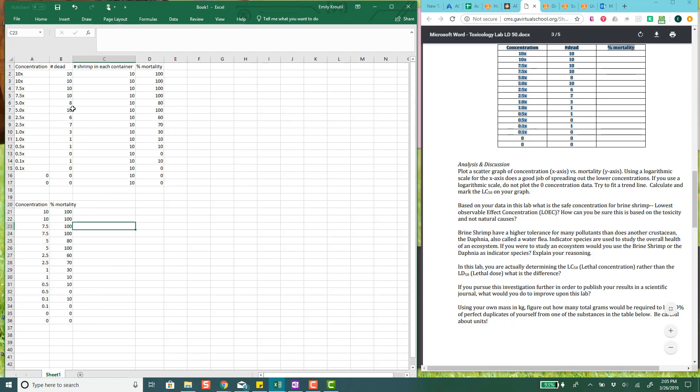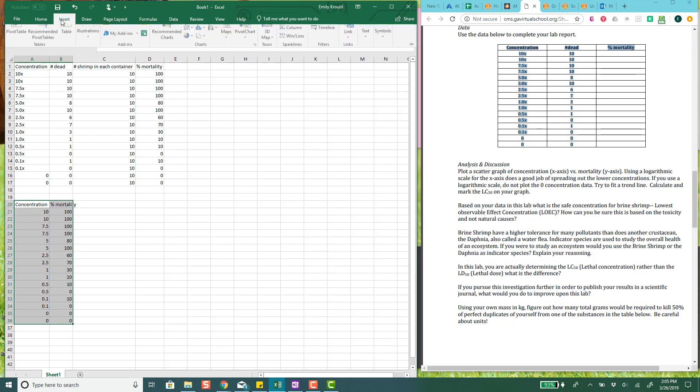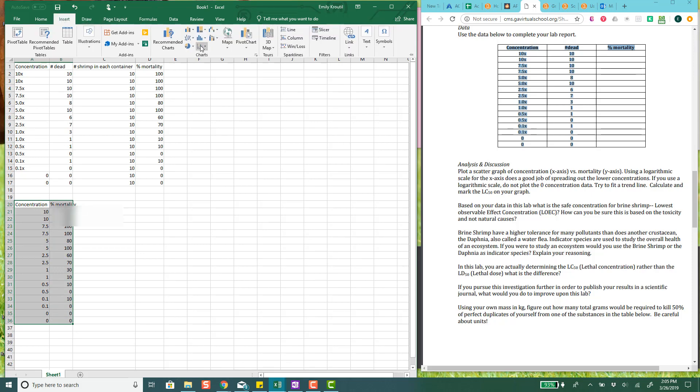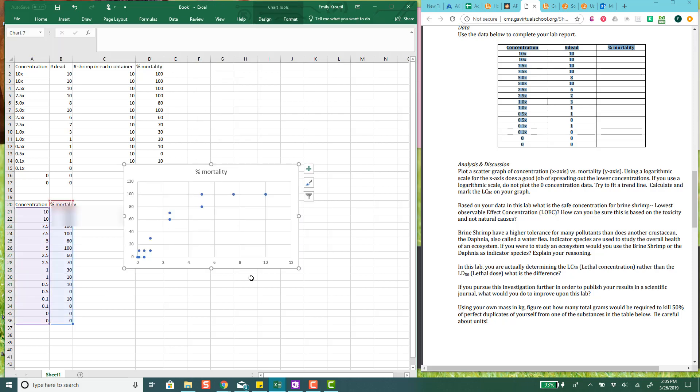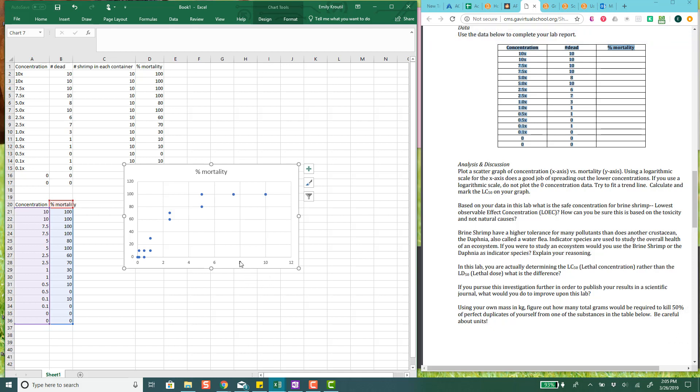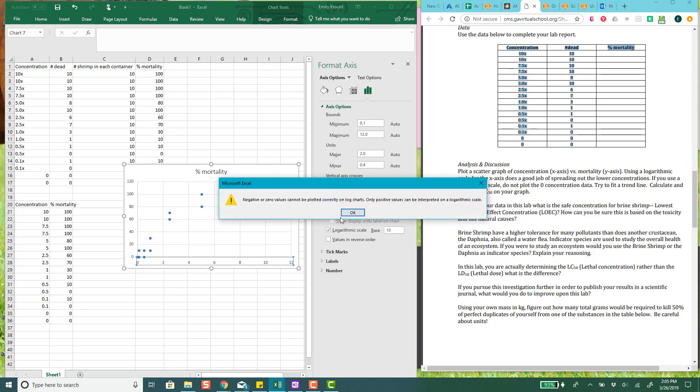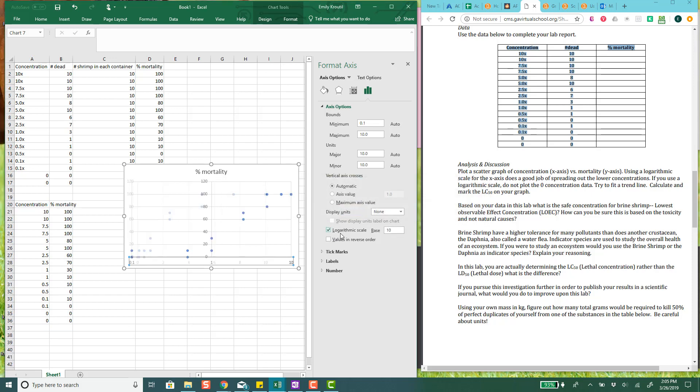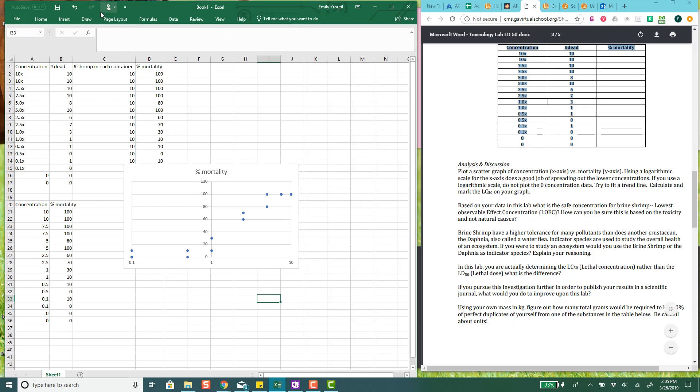Okay. So, after a little playing around with this, the best way to make a graph I found is it doesn't work right if you keep the X's there. So, I got rid of all the X's under concentration. And then I inserted a scatter chart. And so you can see it only goes up to 10, which is great. Now, it says use a logarithmic scale for the X-axis. It does a good job spreading out the concentrations. But if you do that, you can't plot the zero data. Okay. So, this is what happens if you plot the zero data.